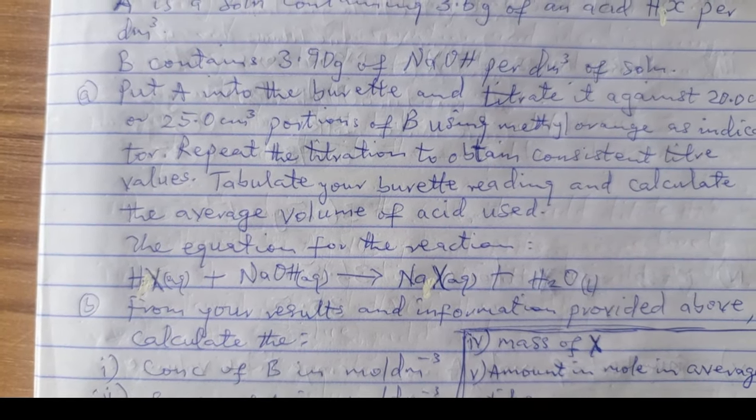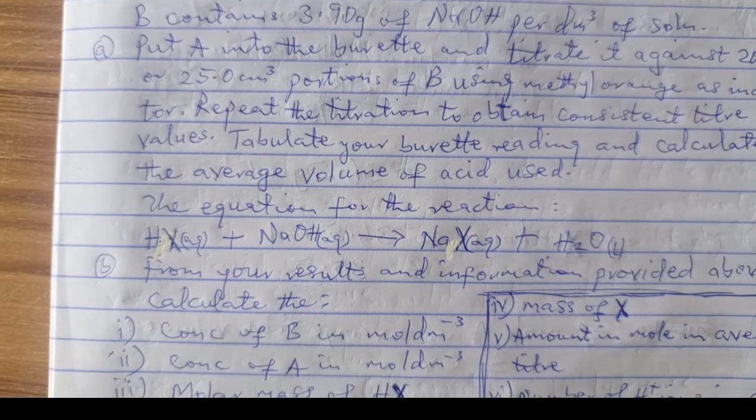The equation of the reaction is as follows.